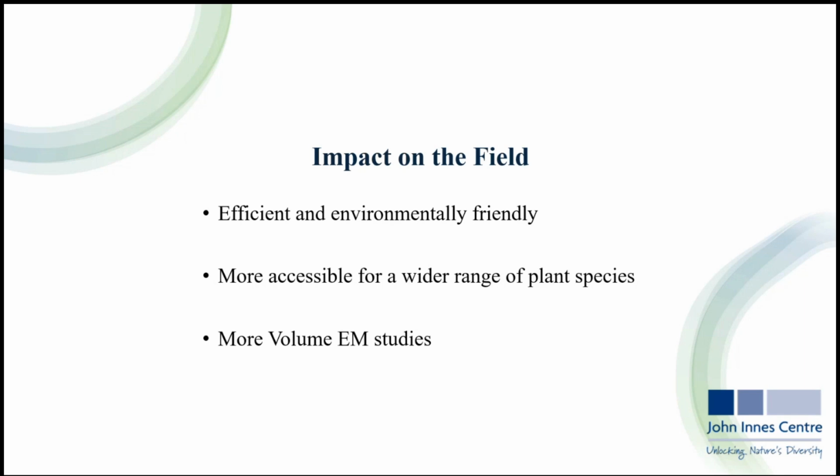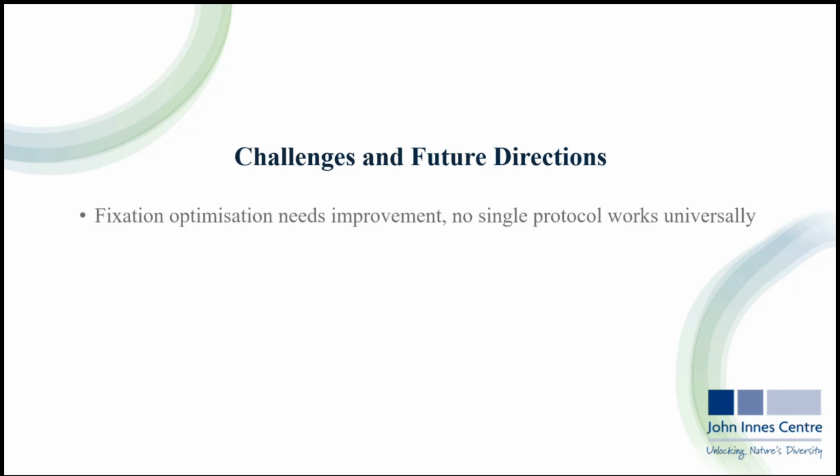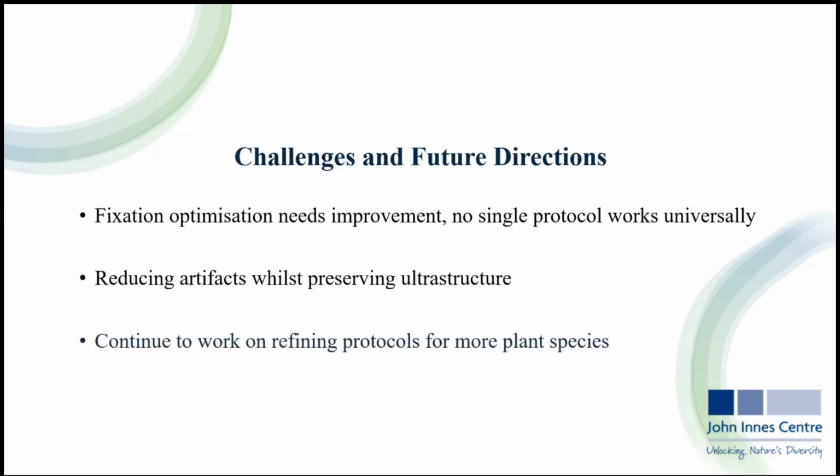And this will then in turn lead to potentially more volume EM studies. So even though we've made progress, there are still some remaining challenges. Plant tissues are highly variable and no single protocol will work for every plant type. It's important to reduce artifacts whilst preserving the ultrastructure of these samples. And we also need to continue to refine these protocols for the BioWave, testing on a broader range of plant material to ensure consistent and high quality results.